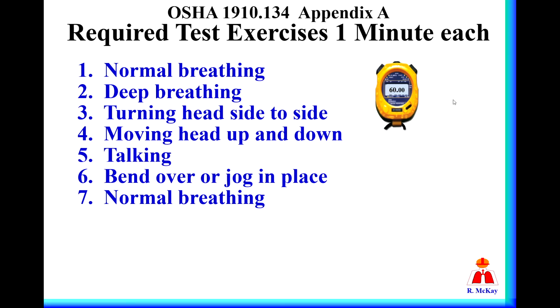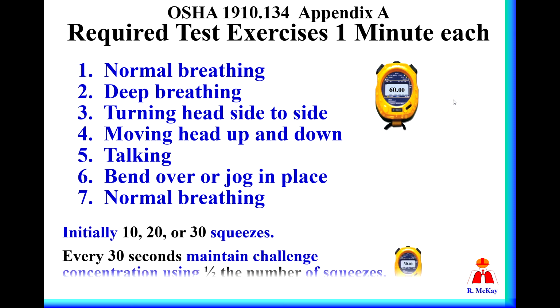So, as a reminder, there were 7 exercises, each of which was 1 minute in duration. Those exercises are listed here in the proper order. Remember, the respirator standard requires the operator to initially use either 10, 20, or 30 squeezes. And then, because the aerosol is diminishing in concentration, we replenish that challenge agent every 30 seconds using 1/2 the original number of squeezes.